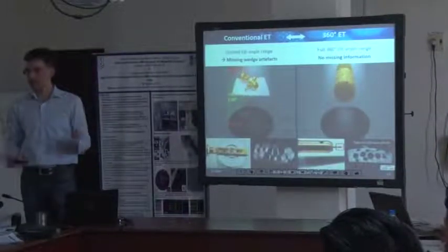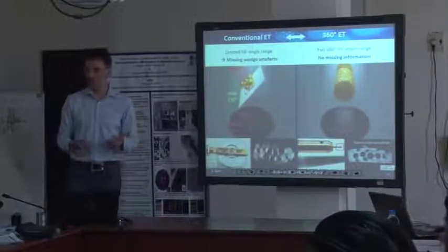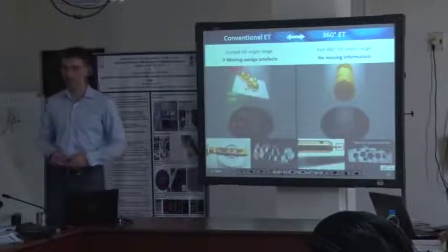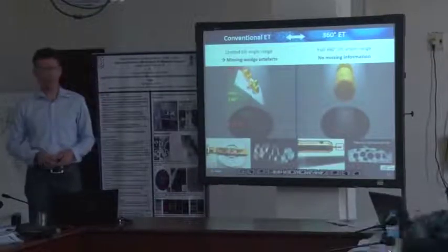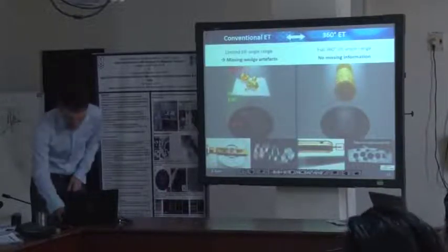The length of the scale bars and the font size have to be the same. It's just simple things, but many people don't address them, and then they fail to convince the editor to send the manuscript out for review.